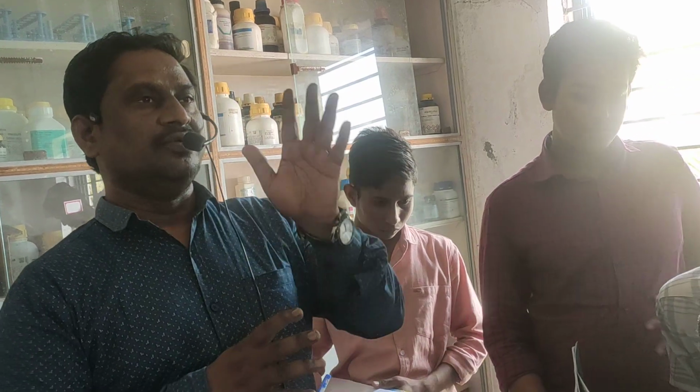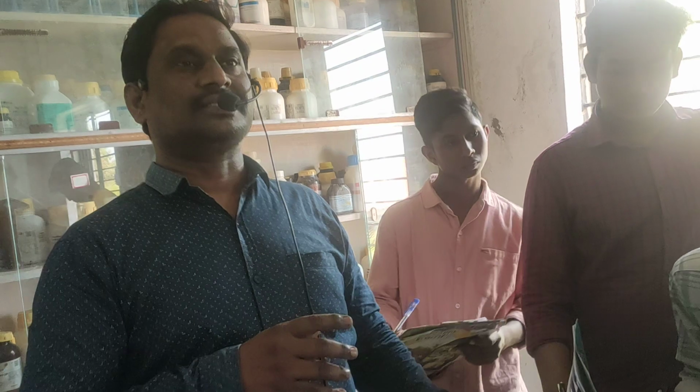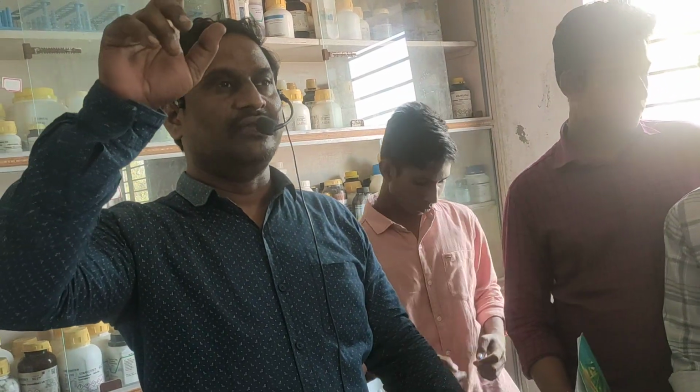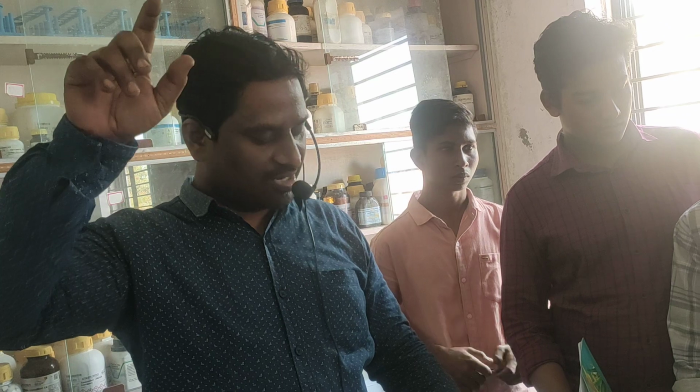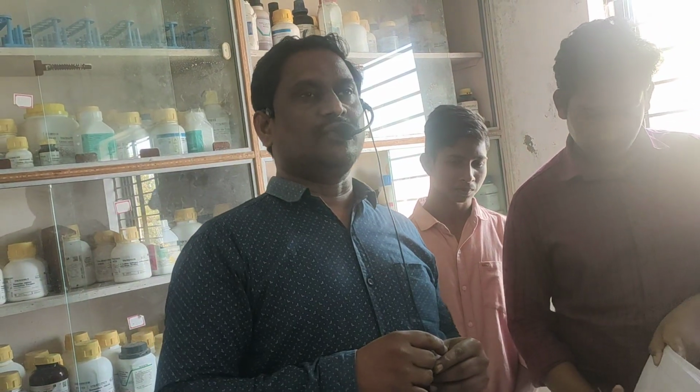First, what we have to do? There are two things. If you take salt and dilute HCl, colorless gas is evolved, then group 1 is present. If you take salt plus concentrated H2SO4 and get fuming gas, then the second group is present.